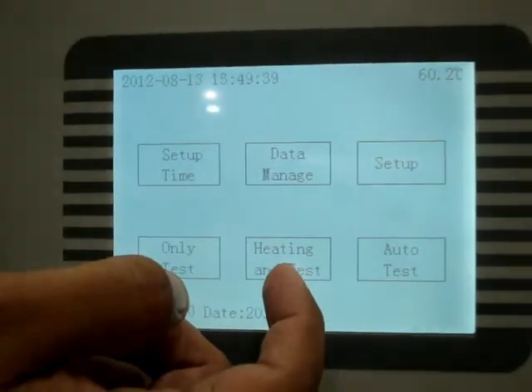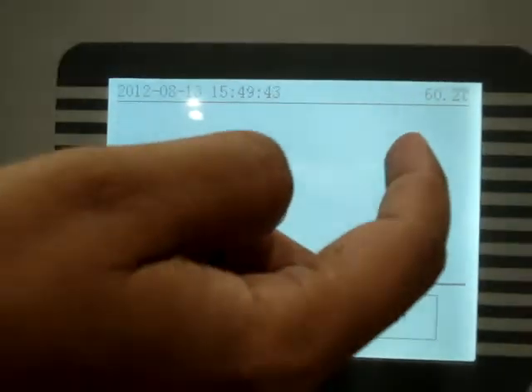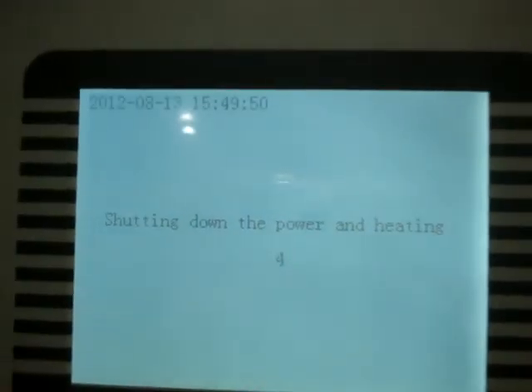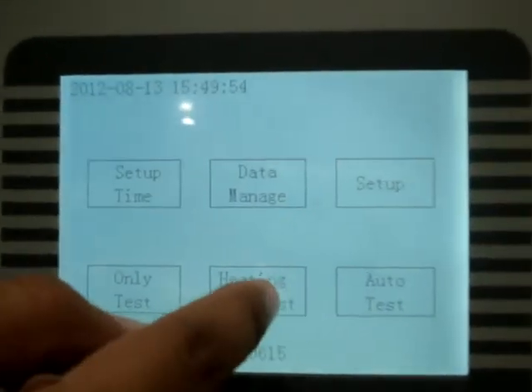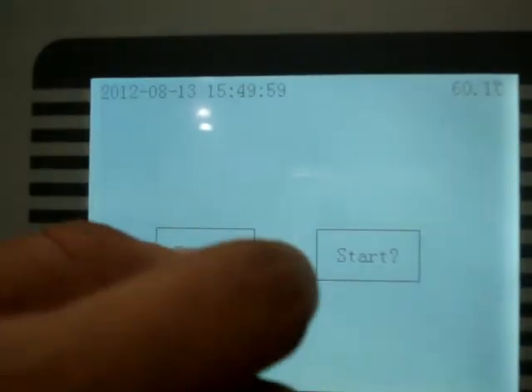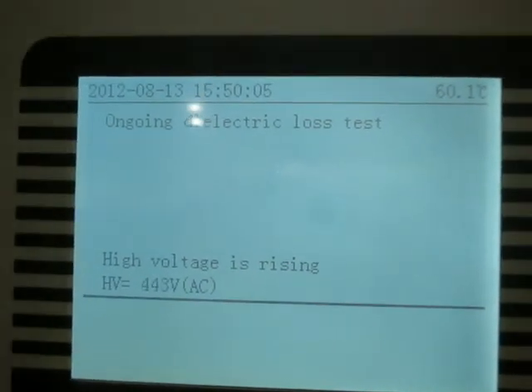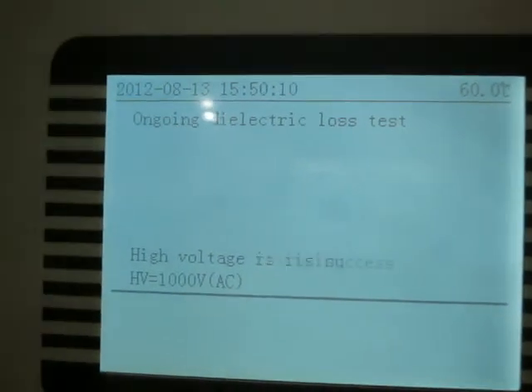Auto Test runs the full heating and test sequence — it waits for the temperature to reach the set temperature before making a reading. You also have an option to return back or stop. The Only Test mode does the test at the current temperature as it is now — it doesn't wait for any kind of heating; it simply tests at whatever temperature the oil cell is currently at.